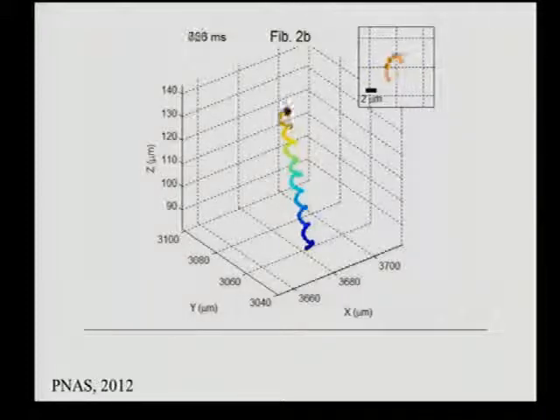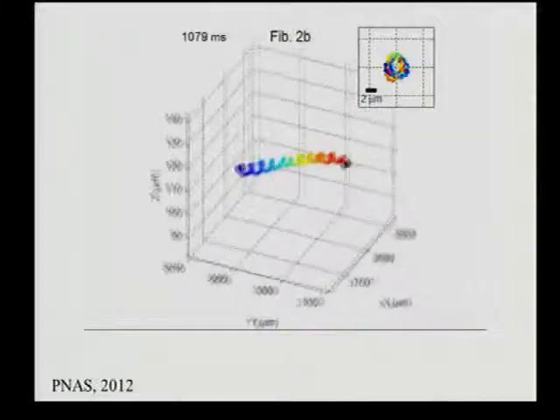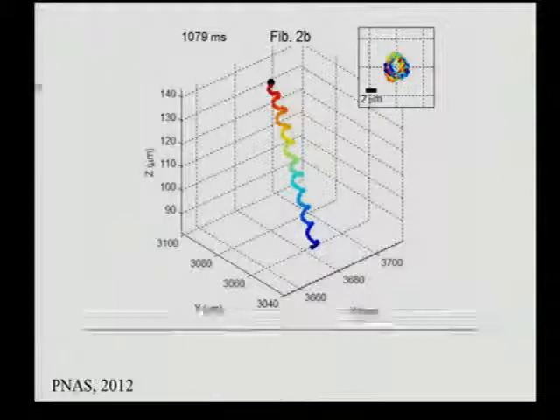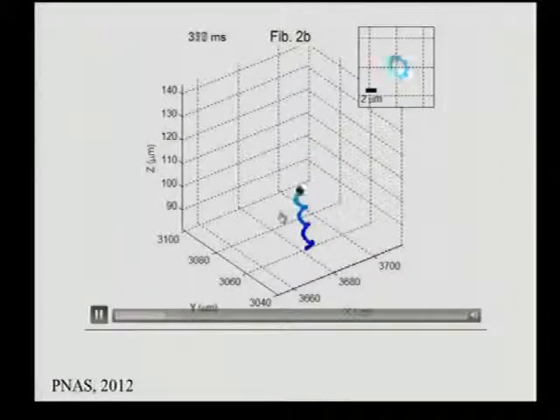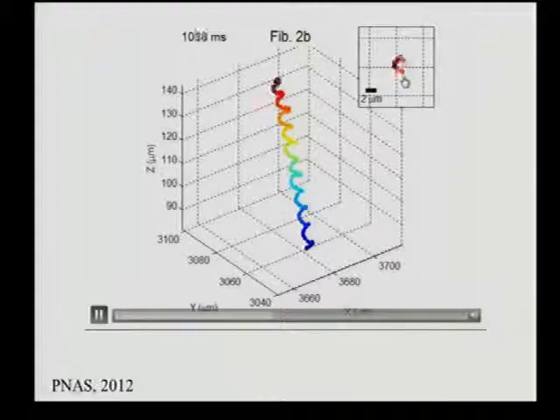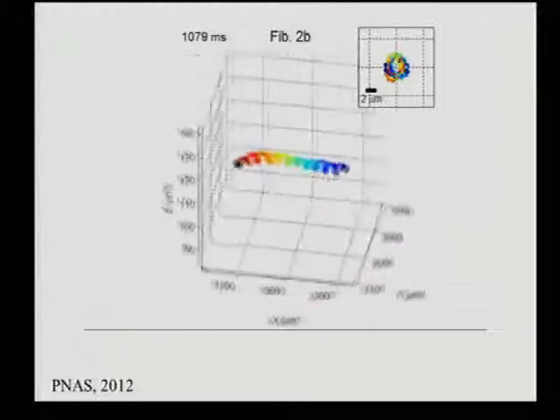This enabled us to look at extremely interesting patterns because of our throughput. This is a human sperm in vitro conducting a helix. It's about a second in motion. It does about 10 rotations per second, very tight rotations, 2-3 microns in diameter. This happens only 4 to 5% of the time.